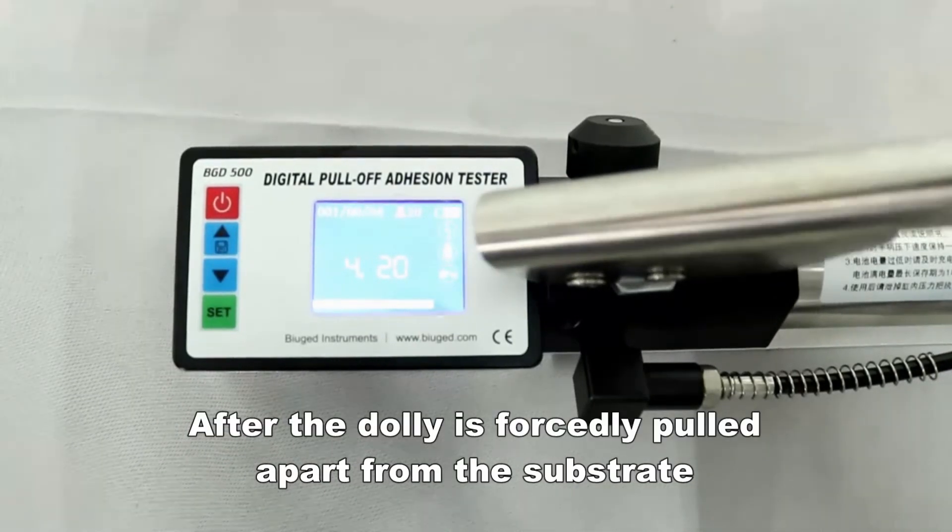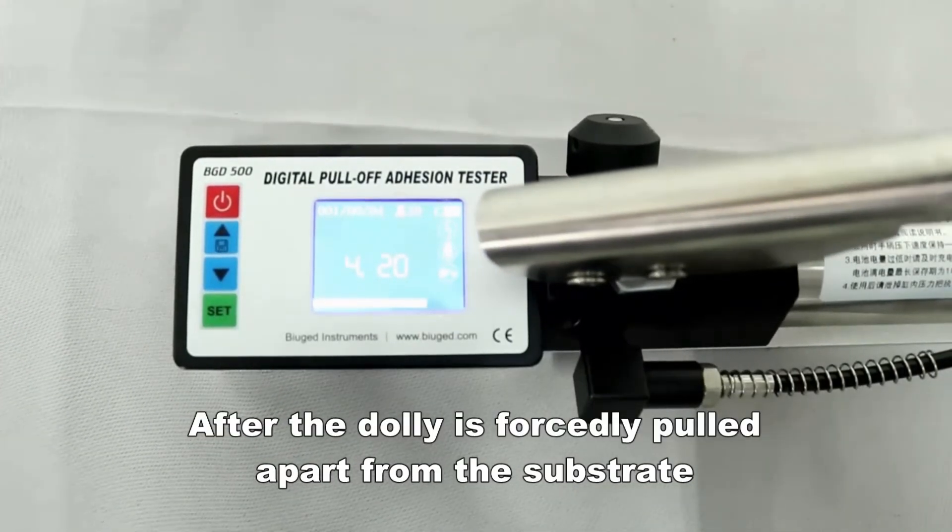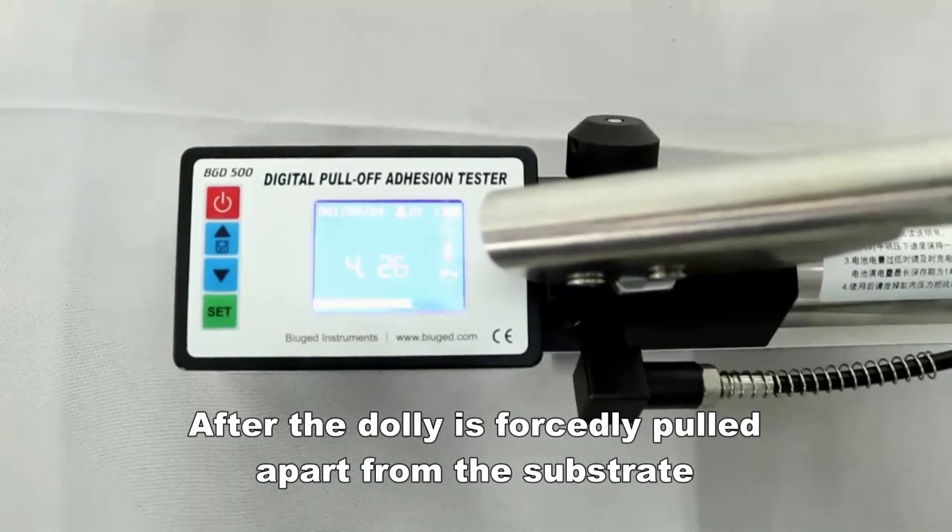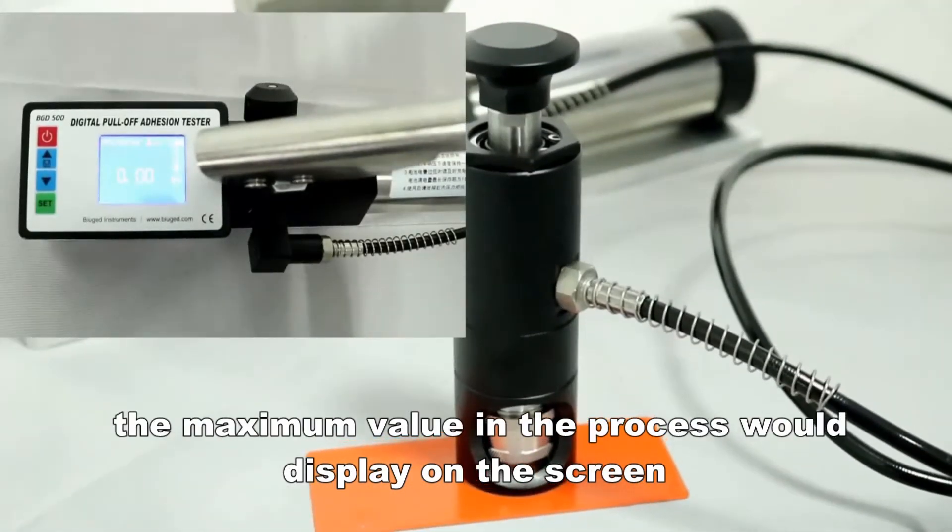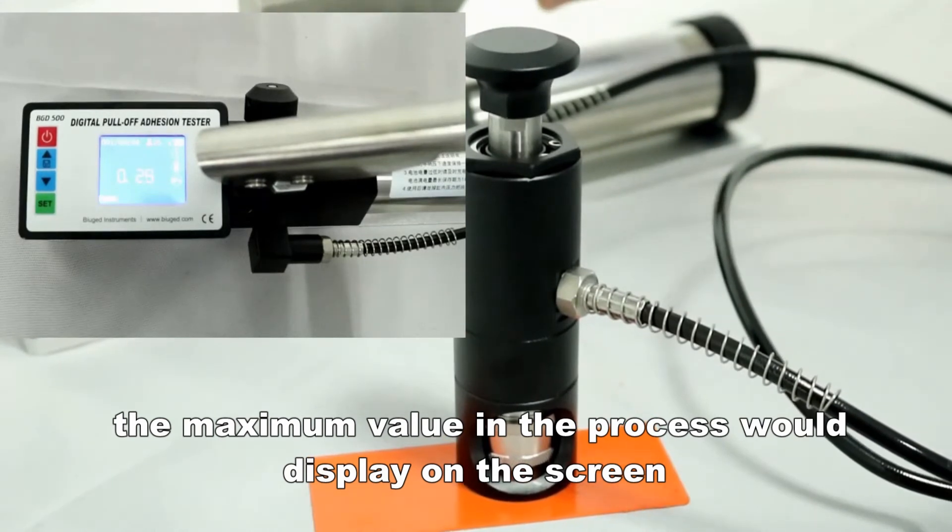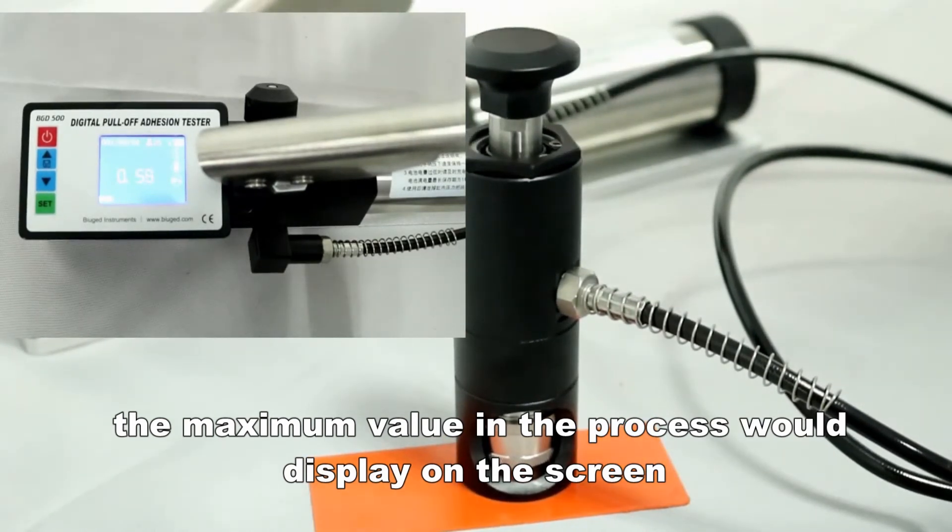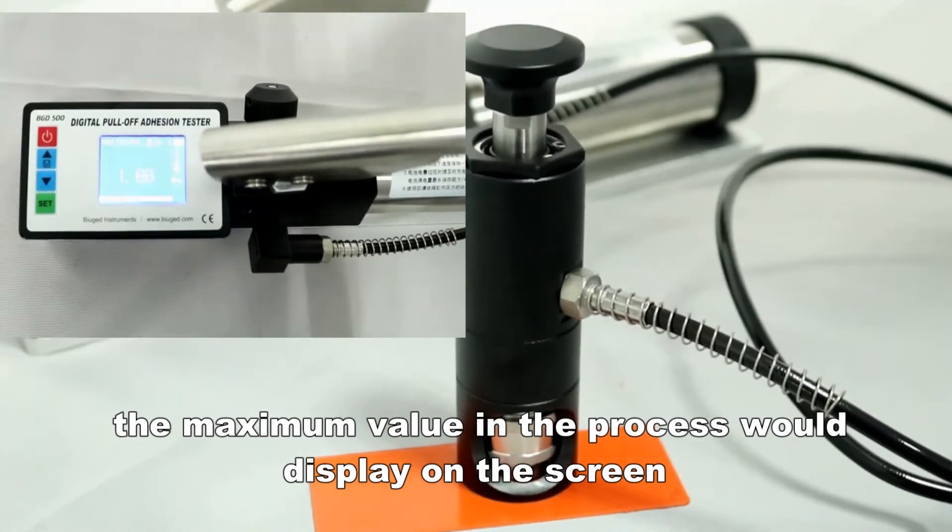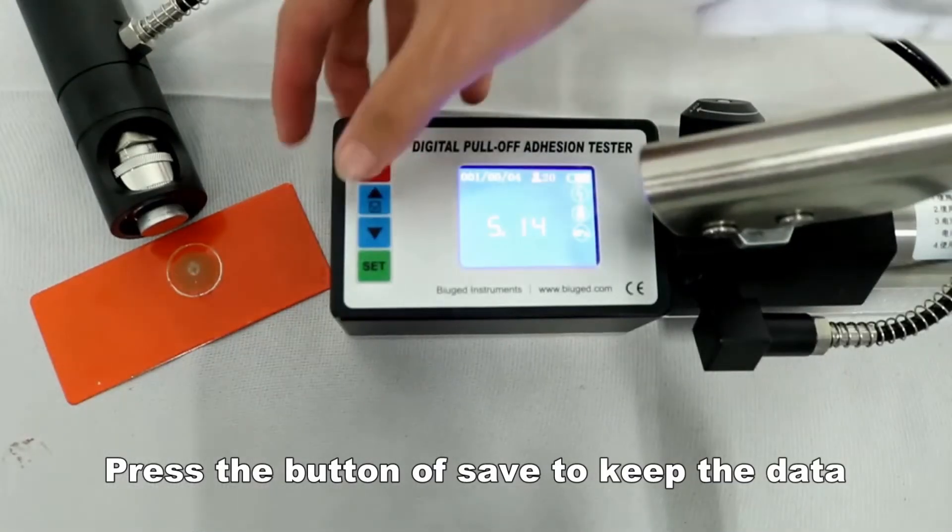After the dolly is forcibly pulled apart from the substrate, the maximum value in the process would display on the screen. Press the save button to keep the data.